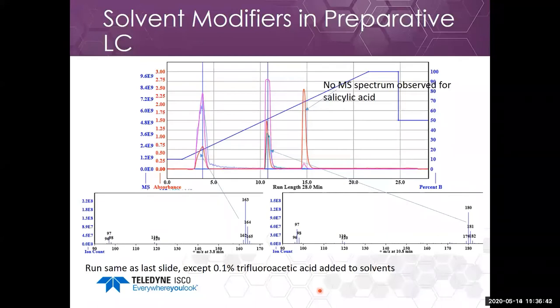One important thing when working with pH: many columns are based on silica gel. Read the instructions for your column, because most columns do not run well under basic conditions — the underlying silica dissolves and you damage the column. Check whether you can run above pH 7 or 7.5 on a silica-based C18 column.